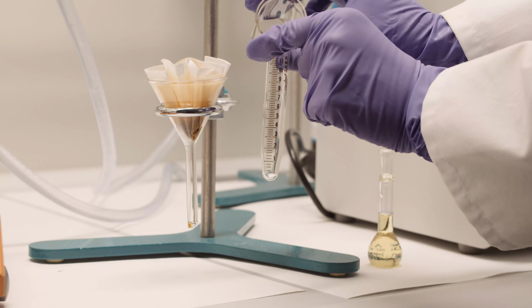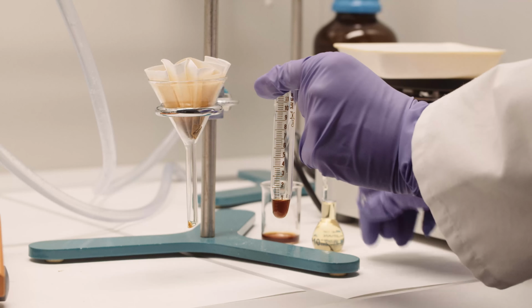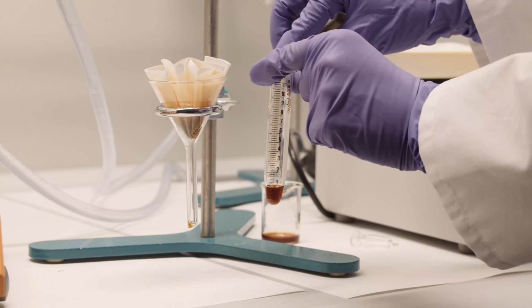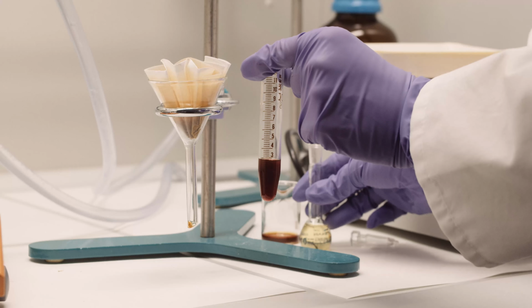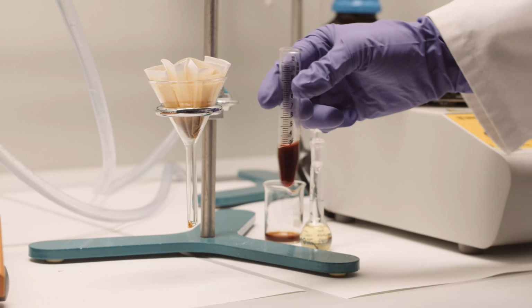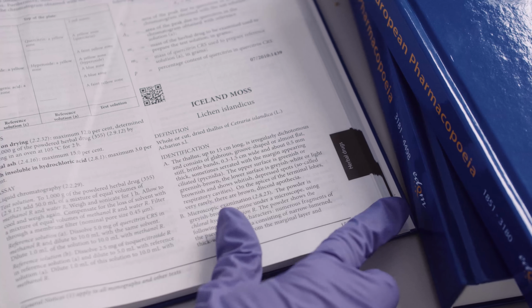When vanillin in hydrochloric acid is added to the solution, it turns intense red. The red color produced by the reaction with this reagent is characteristic of tannins. These are substances due to which oak bark has an astringent action. The general effects of tannins are used to relieve inflammation of the oral cavity, against diarrhea, and in hemorrhoids. On the skin, we achieve an anti-inflammatory and antihidrotic, anti-sweating effect with the help of tannins. Tannins are also used for tanning leather, a process in which proteins coagulate.